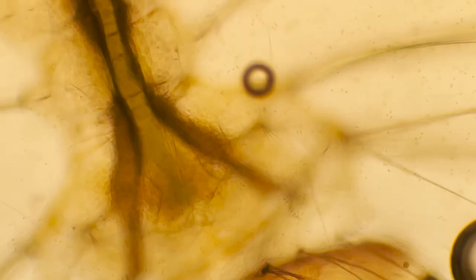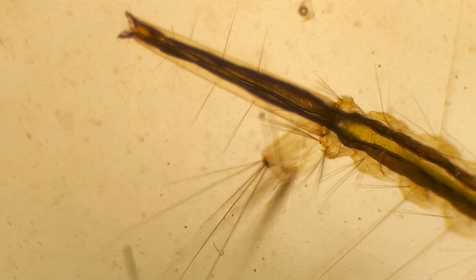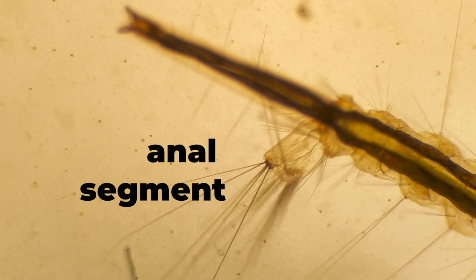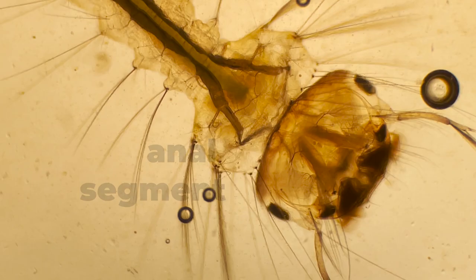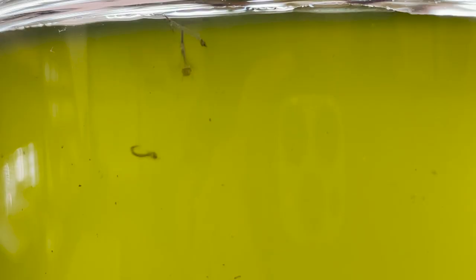While it's still, you can see a pulsating organ that runs the length of the abdomen. That's the insect equivalent of a heart and circulatory system. And at the end, the abdomen splits into the tubular siphon that connects to the water surface, and a final segment with anal glands and gills. Finally, the whole body is covered in an elaborate array of fine hairs, called setae, that are sensitive to touch. I always find it incredible that such intricate anatomy can be so neatly packaged into an animal that's just a few millimetres long and which will completely transform in a matter of days.